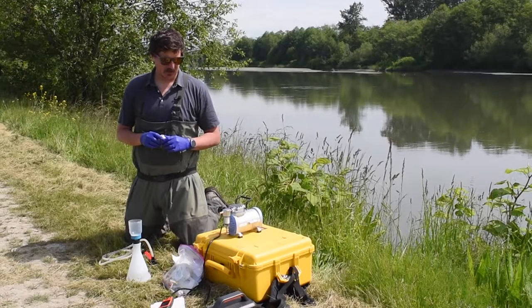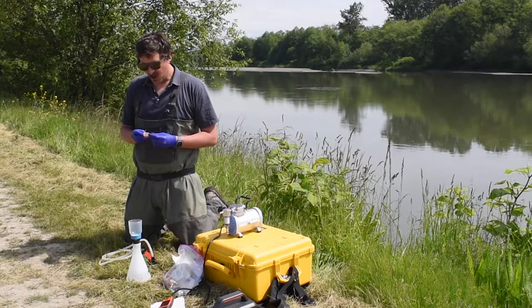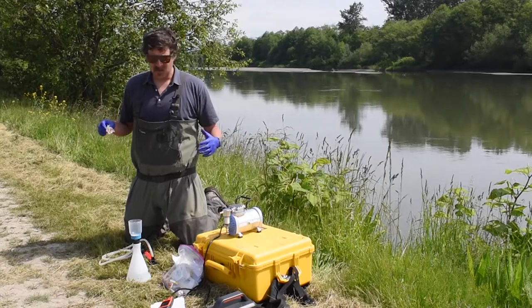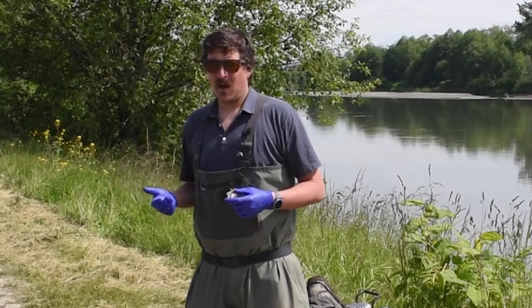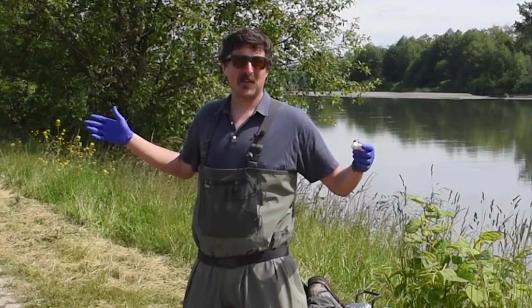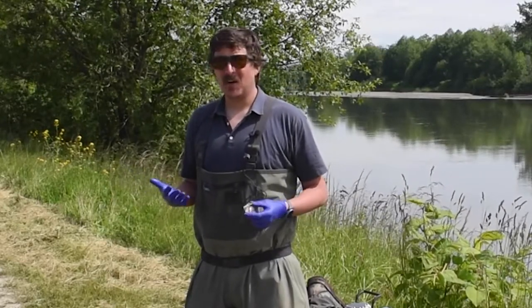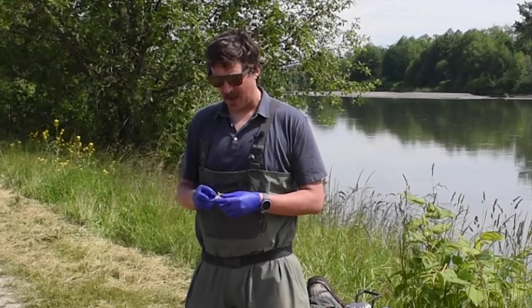We've had a lot of success on the coast using this metabarcoding sampling. It's really interesting because as salmon-focused fish and habitat biologists, we're interested in distributions of salmon. But now we're getting information about things like sculpins, lamprey, and on the coast we have an endemic species called the Olympic mud minnow, about which we have very little information on distributions or life histories. We're collecting information that's extremely useful as habitat scientists, because these are indicator species whose life histories can tell us a lot about the quality and quantity of habitat.